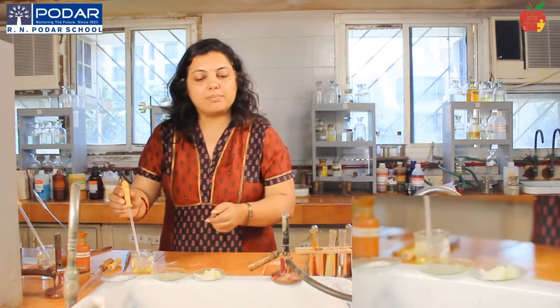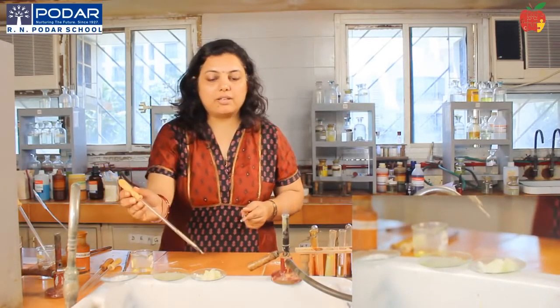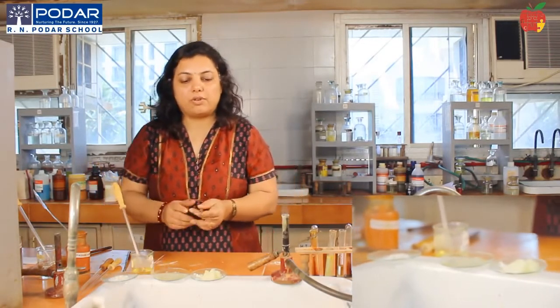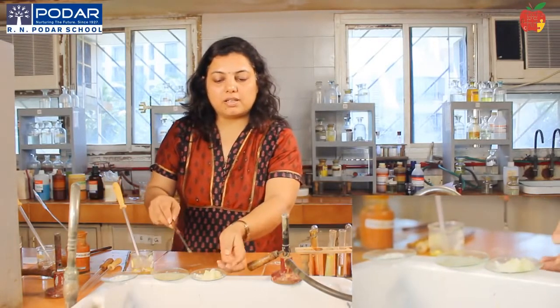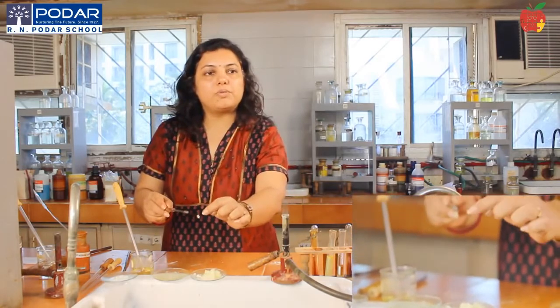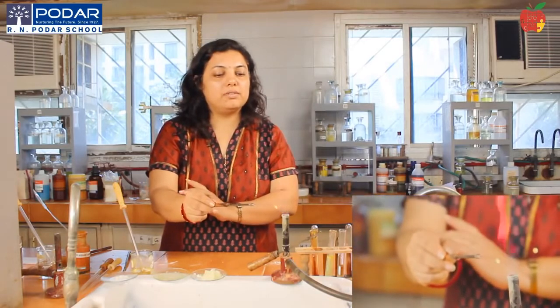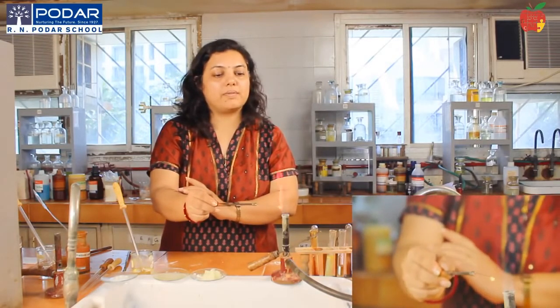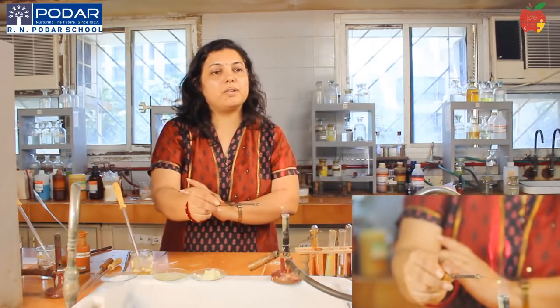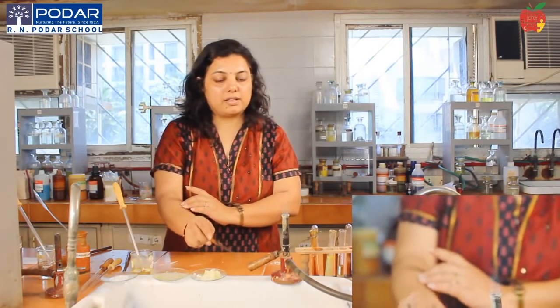Now I have 3 samples. This is your strontium, calcium and barium. To each one of them you will add concentrated HCl, okay, so that a paste is formed. And then you will take a little amount of that paste on a platinum wire. You'll make a loop towards the end of the wire and then put it into the flame. Can you see the color now? This is your crimson red. So this is your strontium sample. So the color which is imparted to the flame, you will be able to identify the cation with it.